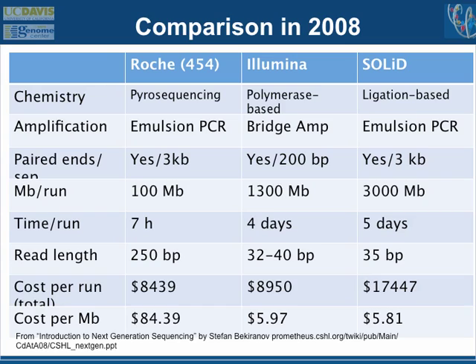Yeah? Is it true that Illumina also has a higher error rate? It has higher what? Higher error?